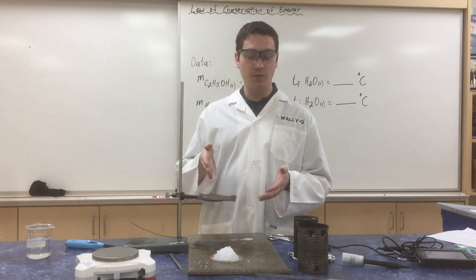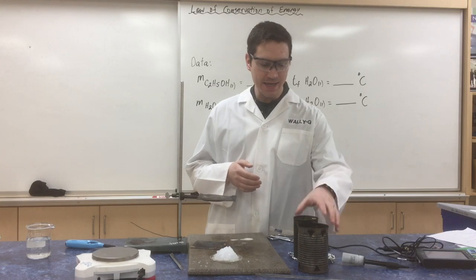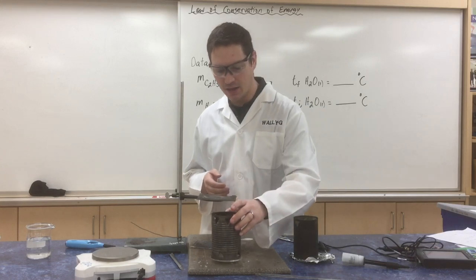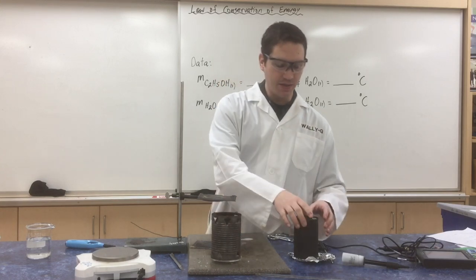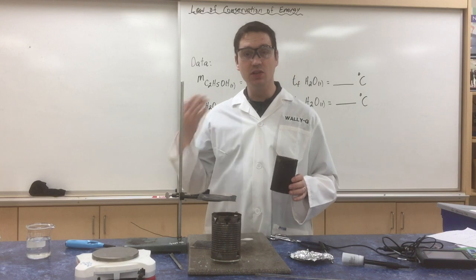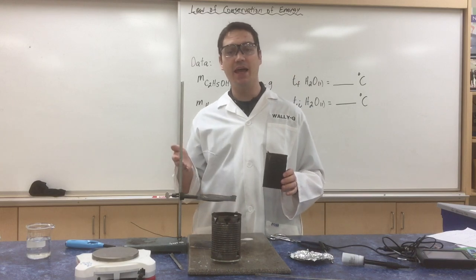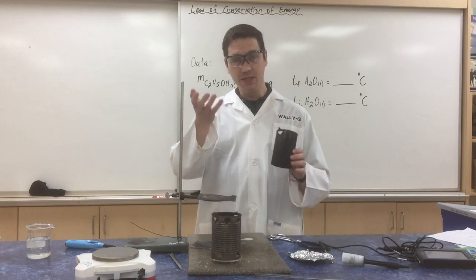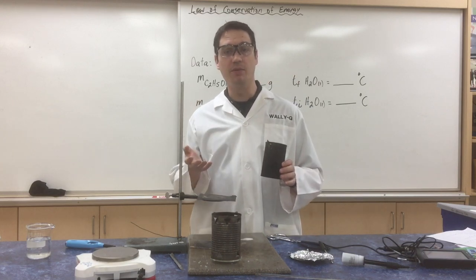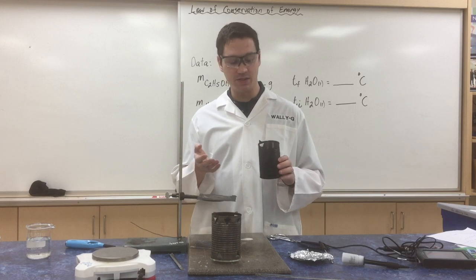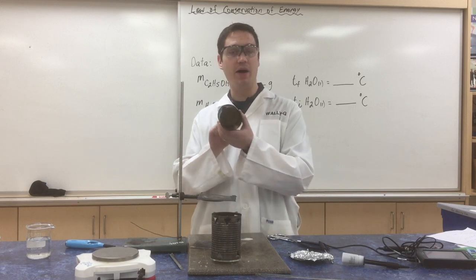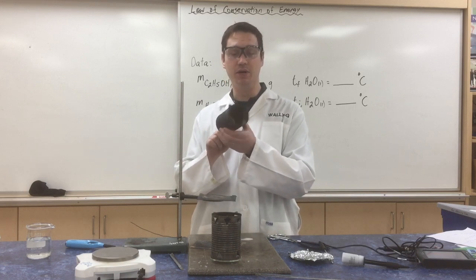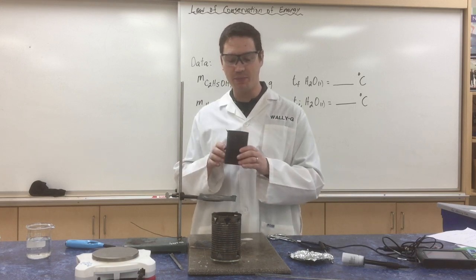So the ethanol is going to be burning inside this metal can calorimeter, and the energy that's lost by the ethanol is going to be released in the form of thermal energy, and that's going to be absorbed by the water that we will eventually put in the top can.